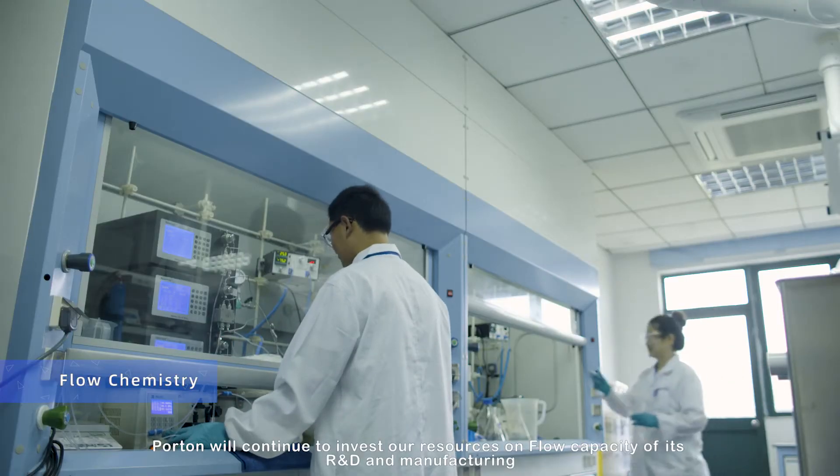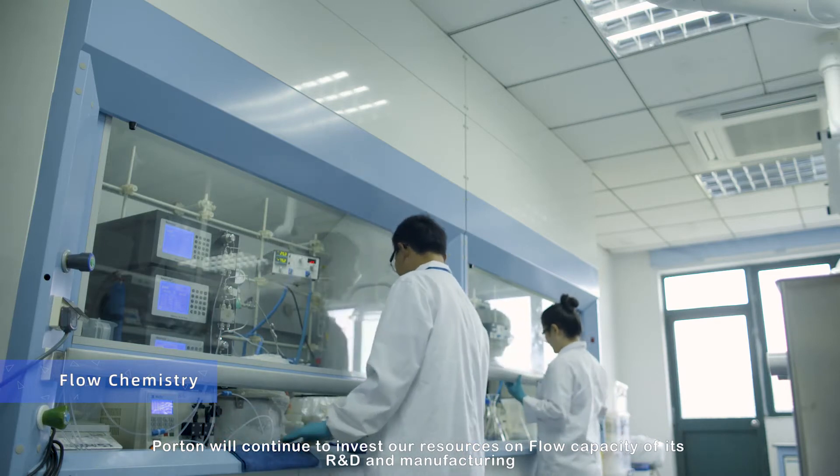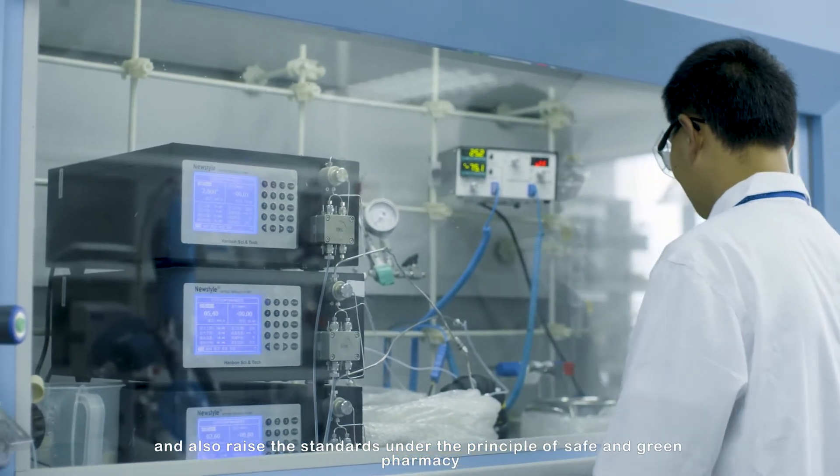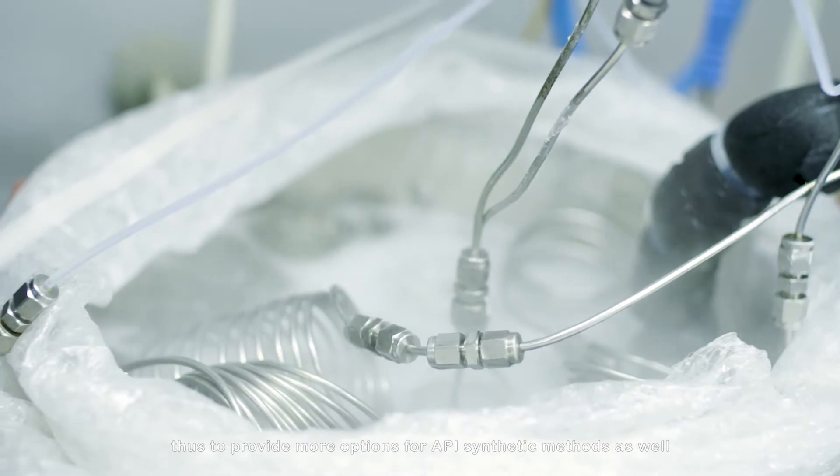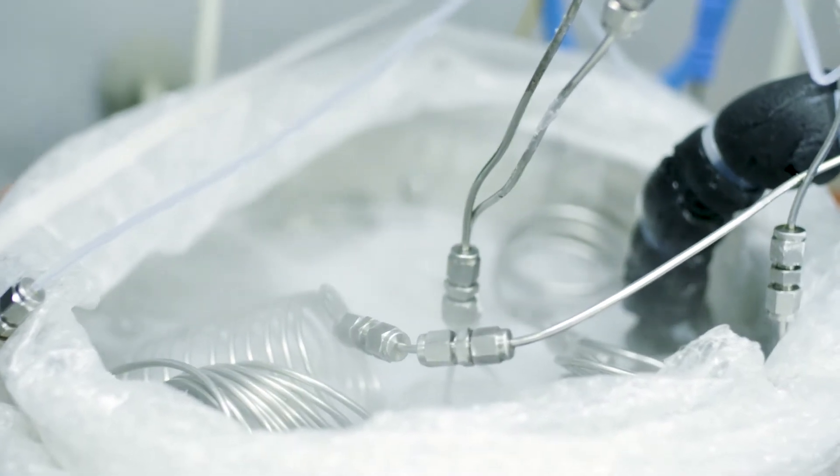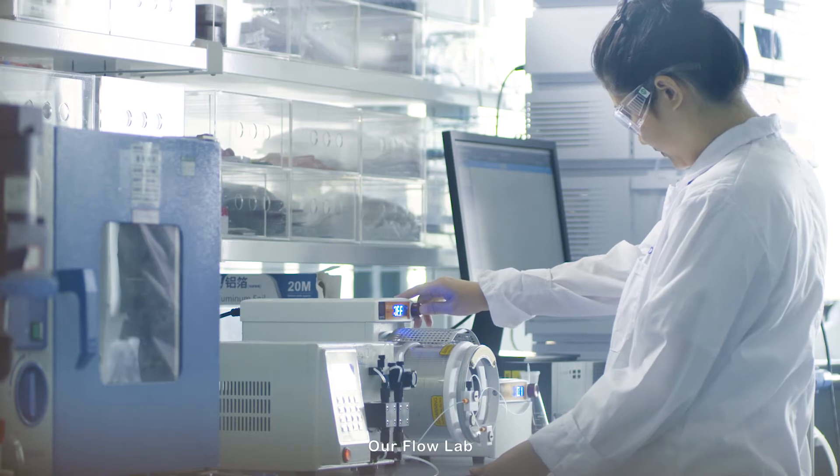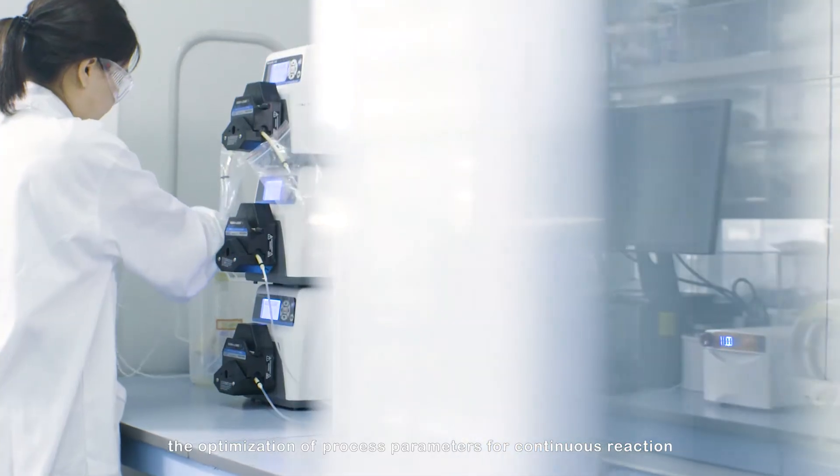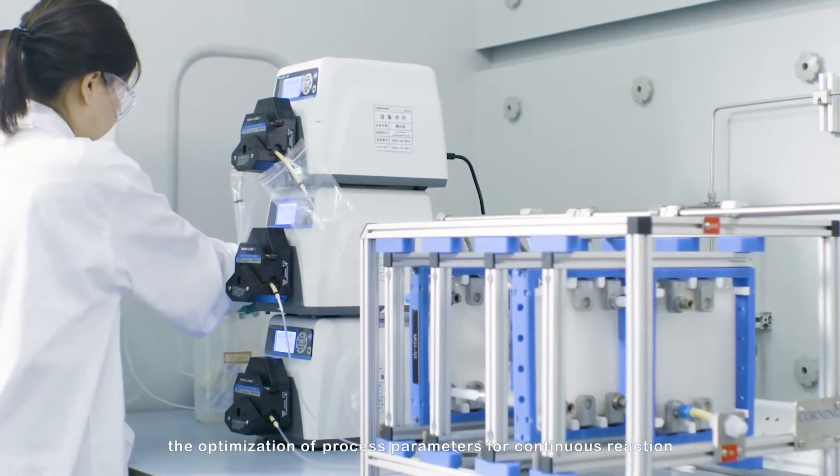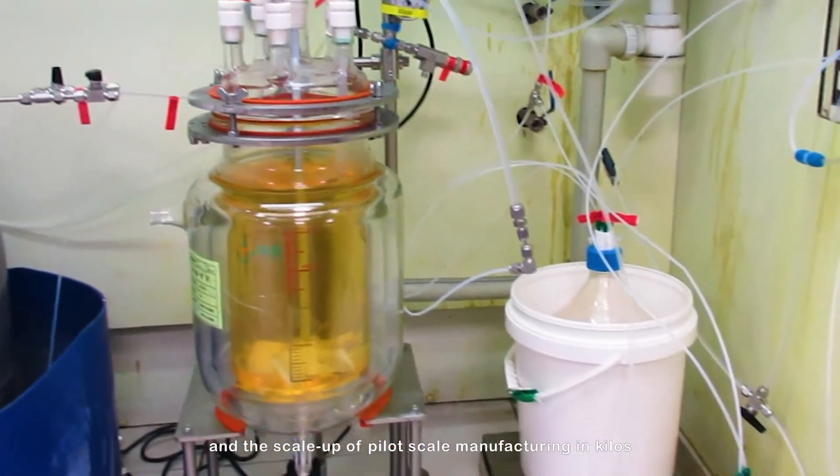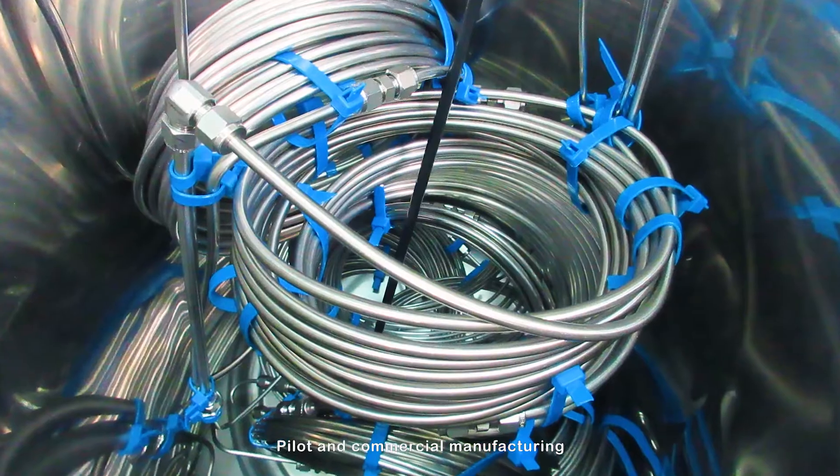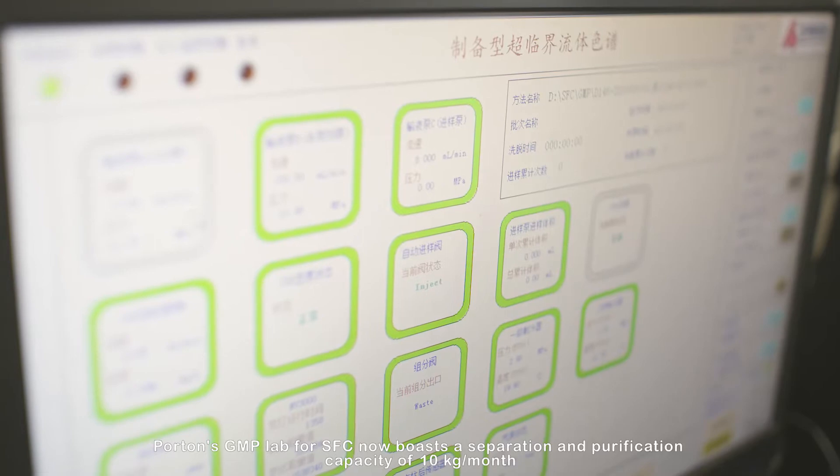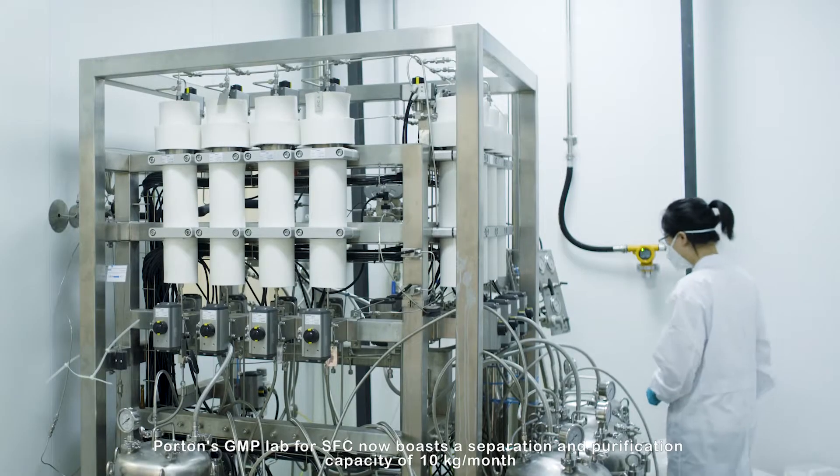Porton will continue to invest our resources on flow capacity of its R&D and manufacturing, and also raise the standards under the principle of safe and green pharmacy. Thus, to provide more options for API synthetic methods. Our flow lab mainly focuses on the process development and screening of continuous reactions, the optimization of process parameters for continuous reaction, and the scale-up of pilot-scale manufacturing in kilos, providing support for commercial manufacturing. Porton's GMP lab for SFC now boasts a separation and purification capacity of 10 kilograms per month.